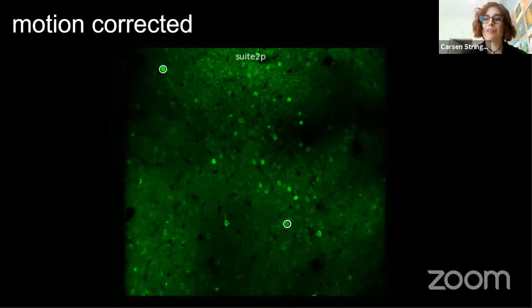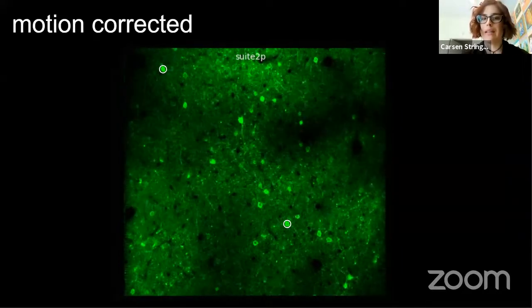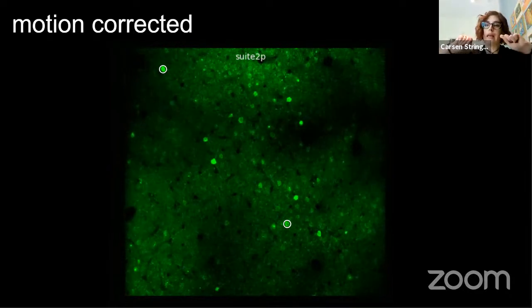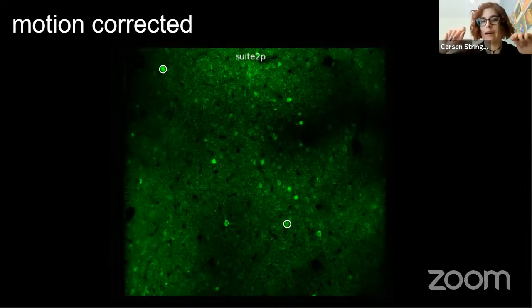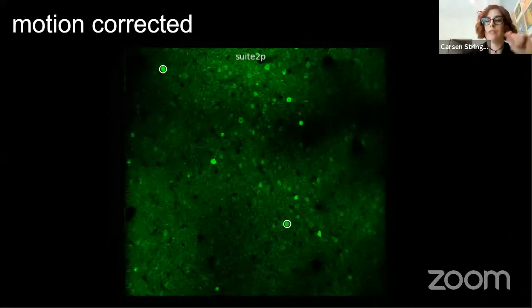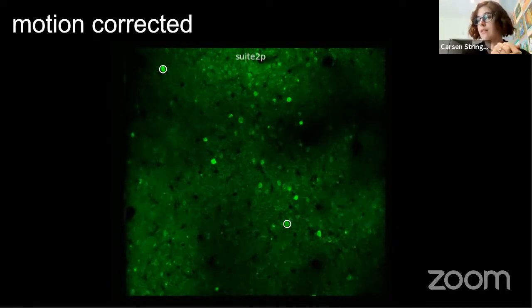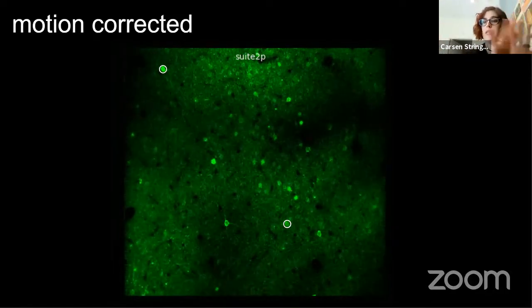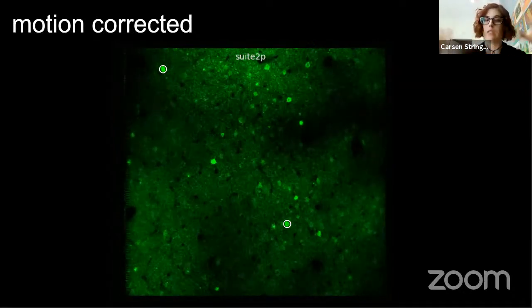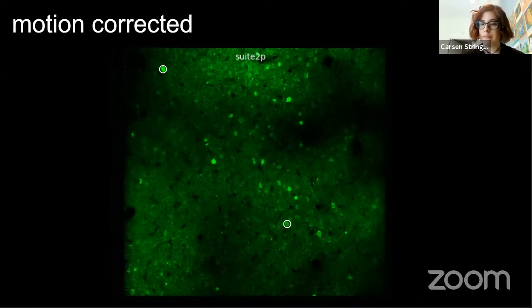So there will be neuropil signals there too. So it's a little bit trickier. But yeah, you could take, for instance, random pixels all over the frame that aren't pixels inside the cells, and then compare those, because the neuropil will be spatially correlated. This is just an example, I haven't actually done this. So if you take a bunch of random pixels, you might get a better sense of some things.